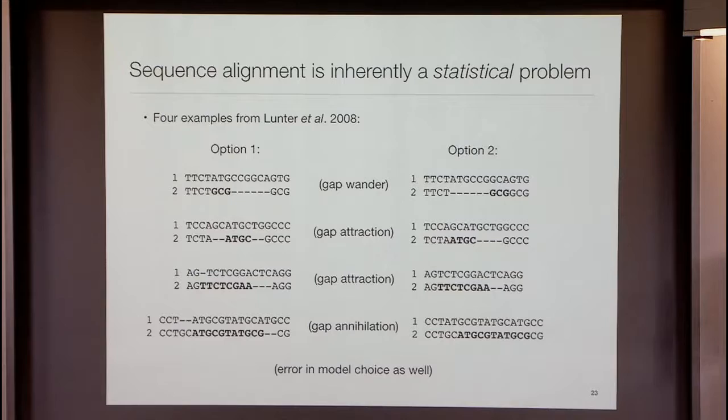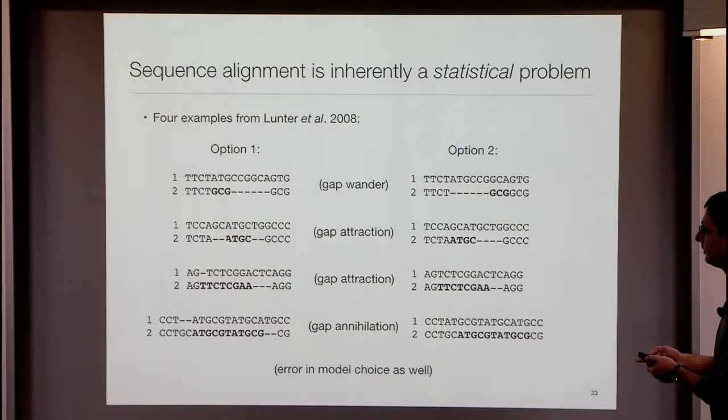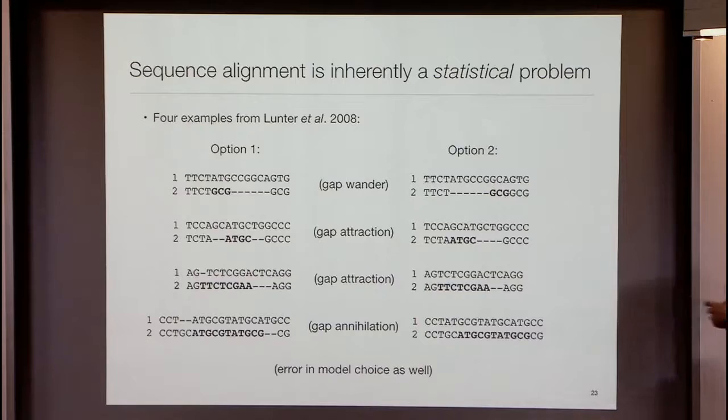And then there's gap attraction. If you have a sequence and then in the middle an exact match, alignment programs tend to glue these together because it becomes difficult to model everything, and I think Dan Gusfield said this: you run out of scores and scoring schemes eventually, and so you get these kinds of issues. I like this one. This might be the true evolutionary story, but it's sometimes just easier to shove everything together, and it gives you a slightly higher score by whatever metric you pick.